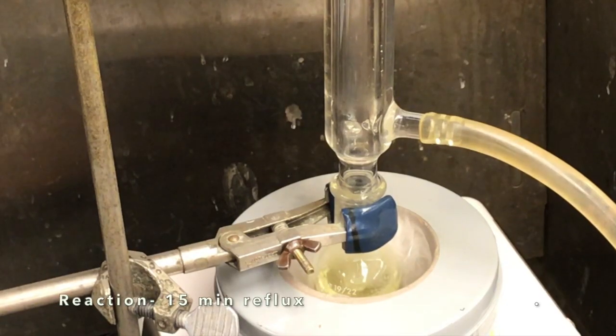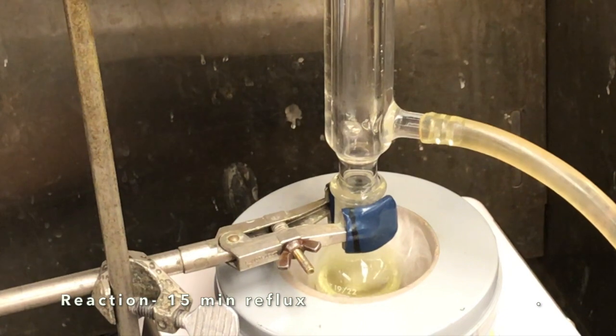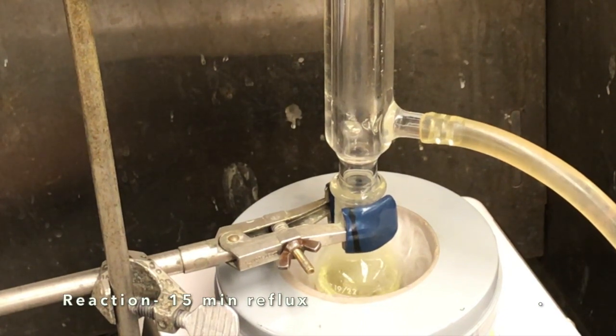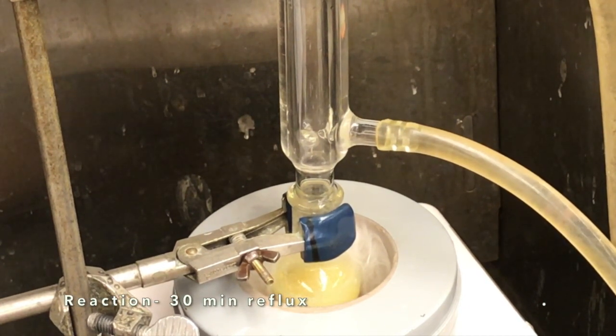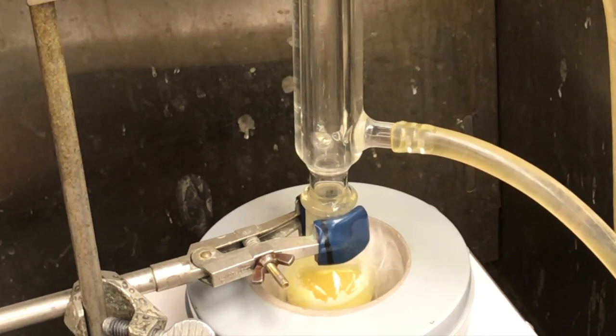Okay, so now let's see what our reaction looks like. So this is after 15 minutes of reflux. You can see that it's starting to turn slightly yellow. And then we'll fast forward to 30 minutes of reflux. Now it looks bright yellow. It doesn't really look clear anymore. And then finally, after 45 minutes of reflux, it still looks pretty bright yellow, and you can see there's a lot of solid on the sides of the flask.